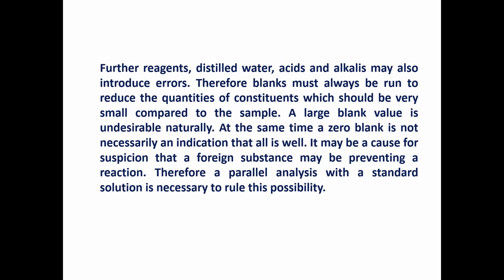So, after subtracting the blank, when the sample and analyte are showing the same absorbance within the experimental error, of course, then only it means that we do not have a blank problem. So, so much I want to tell you about the blank. It is important for us to understand the significance of the blanks, especially in spectrophotometric procedures.